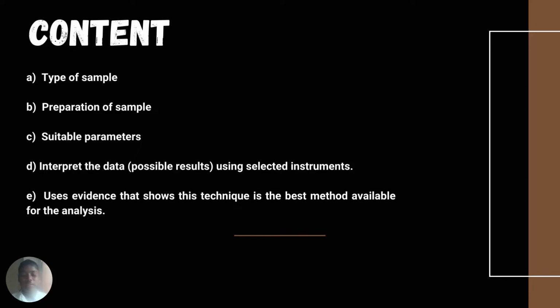Those are the contents of our presentation: type of sample, preparation of sample, suitable parameters, interpreting the data, and using evidence that shows this technique is the best method available for the analysis.